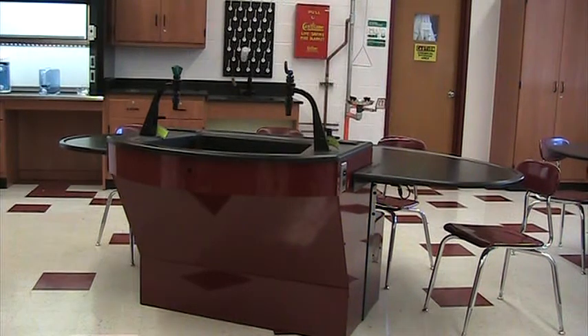Hi, my name is Nat Longo. I wanted to introduce you today to the Axis Infinity Table. The Axis Infinity Table is unique in design in that it allows a lot of flow within the room. It is a combination lecture-lab unit.